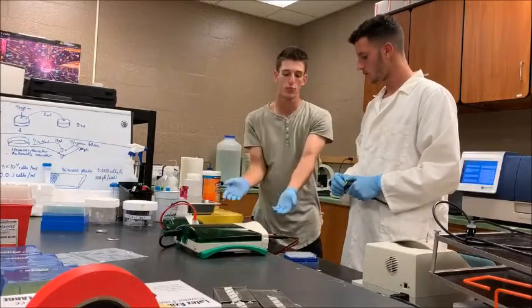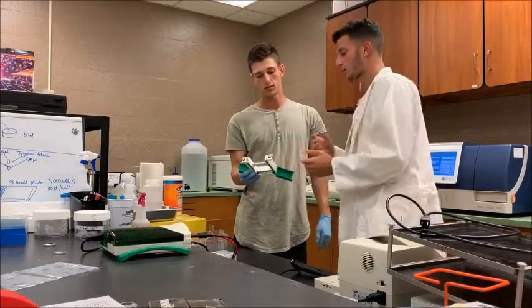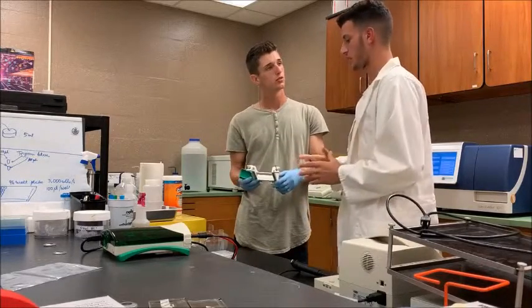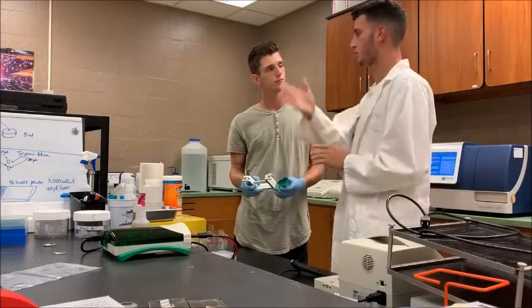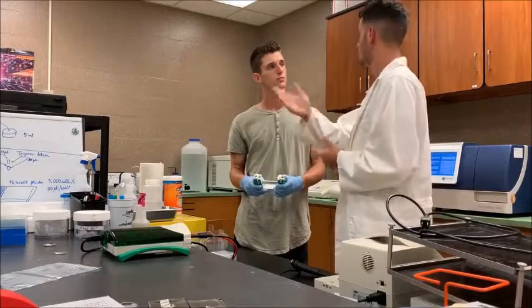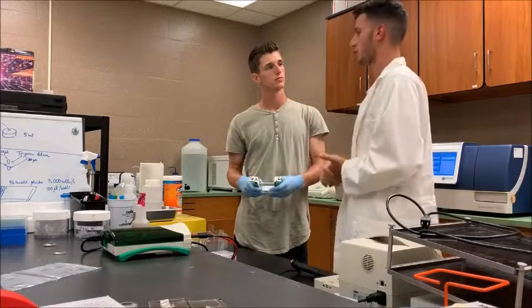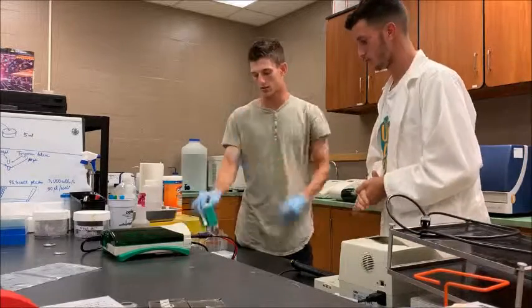So we crack this open and get the gel, and then we bring it where? So yeah, you will crack the gel out, and then you will stain the gel with Coomassie dye that will allow you to visualize the gel with the molecular imager. Then we'll place the stained gel in the imager, and we'll visualize it with the specific program. Okay. Do you want to go see the UV imager?